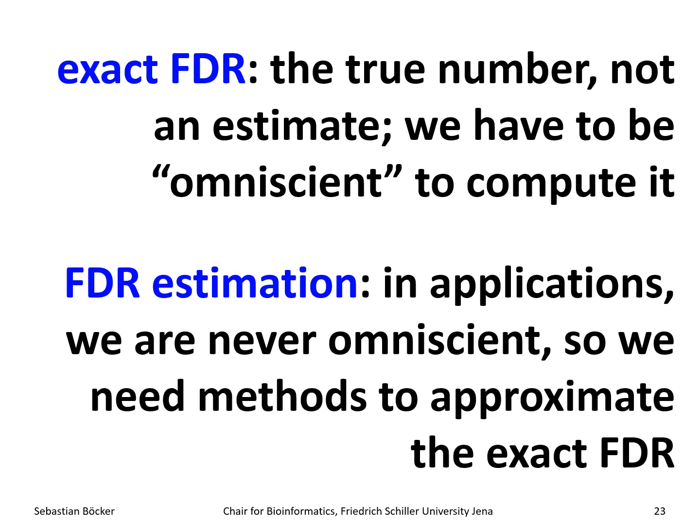Now here comes a very important point that I noticed many people don't get at first glimpse, so I will spend a little bit more time on that. When I talk about false discovery rates throughout this talk, I'm almost always talking about exact false discovery rates. Many slides from now we'll come back to FDR estimation very shortly, but up to that point, we are only talking about exact FDR.